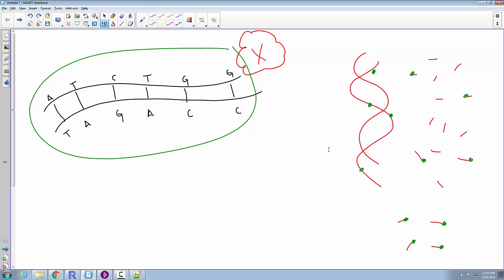Once you do that, if you can align those reads back to the genome, you can find where the transcription factor bound. So if we were to take that read and align it back to the genome, that would tell me at that location in the genome, transcription factor bound. So I could use next-gen sequencing to query the genome for where this transcription factor binds.